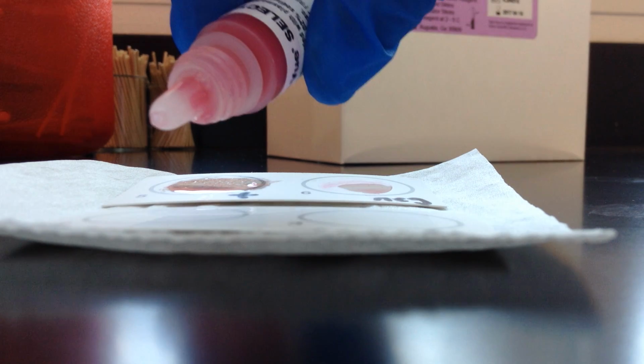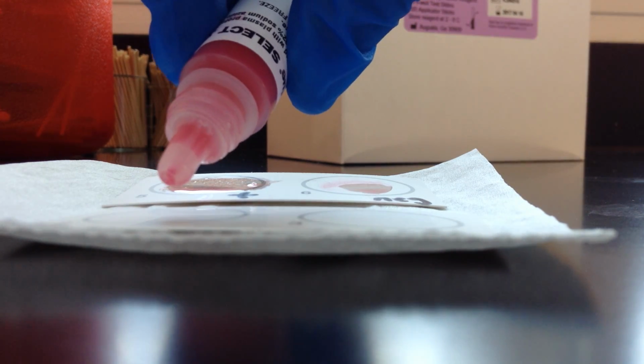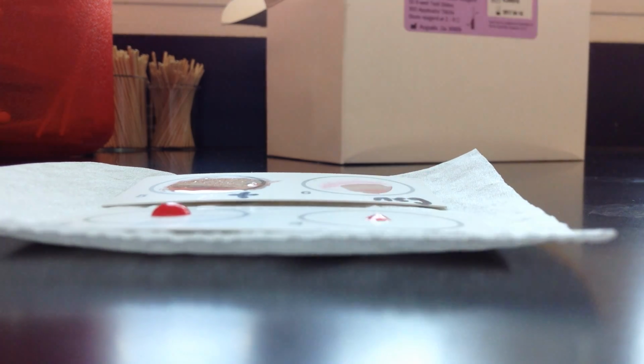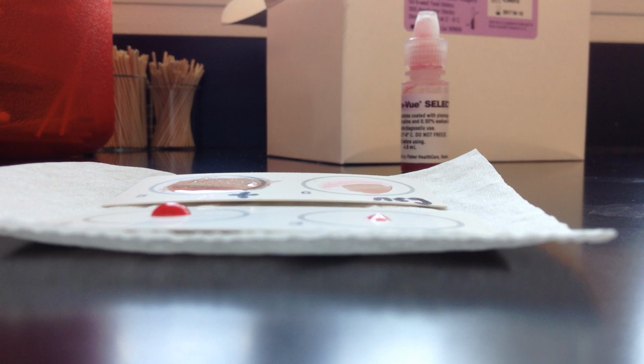So the tools that are provided with this particular kit are sort of these kind of hockey stick shaped tools. Because they do have these sharp angles, be cautious when you pick up bacteria not to dig down into the agar. A generic plastic loop would work well also. So I'm actually going to place the reagent on there, and I really only need one drop, and if you can make it even a small drop, that works well. Okay, because otherwise you have to wait for it to evaporate. So less is more here.